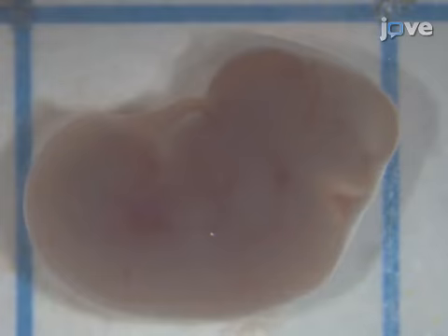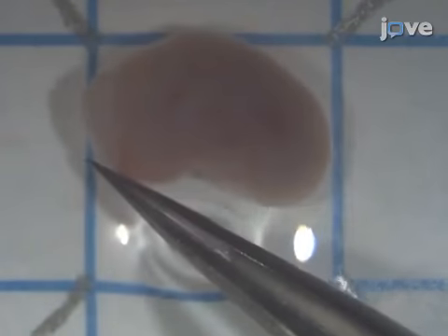Using 2 autoclave sterilized fine forceps and starting at the intersection of the developing telencephalon and diencephalon, pull simultaneously anteriorly and posteriorly to remove the head.